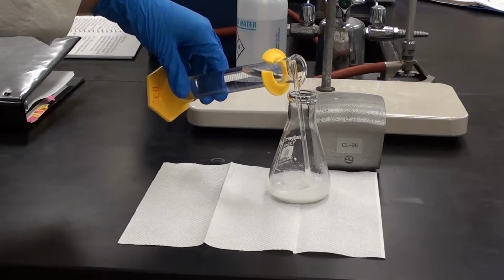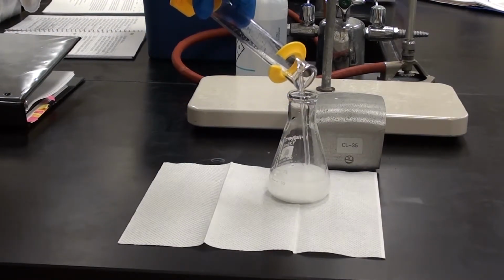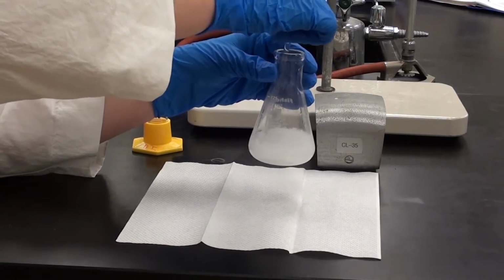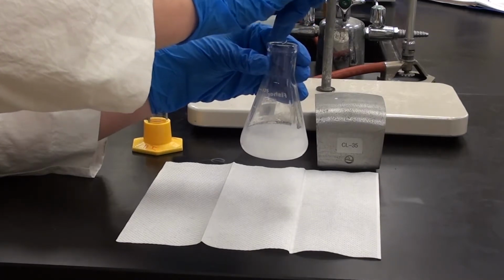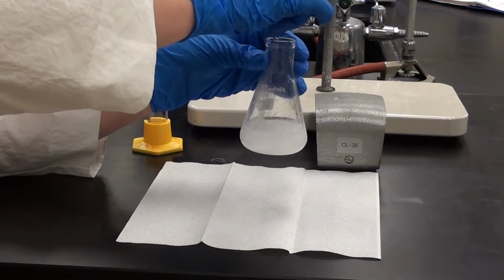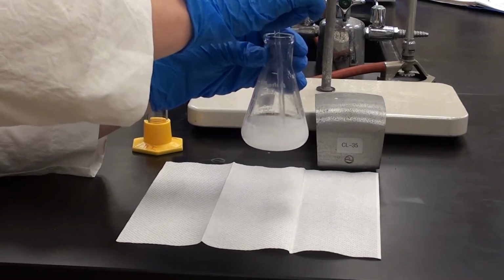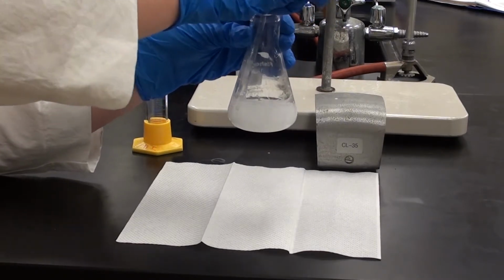Now the water is being added to decompose the excess acetic anhydride, and when you're doing the math here, you'll find out that by doing the limiting reagent problem, the salicylic acid here is limiting and the acetic anhydride is the other reagent. And we have to get rid of that somehow. We can do that by adding water to it, and that will decompose it and just leave us with the aspirin floating around in the water solution here. The next step will be to take that and filter it using the Buchner funnel. Let's go ahead and do it.